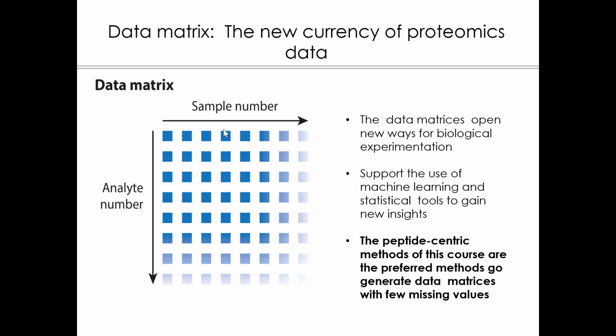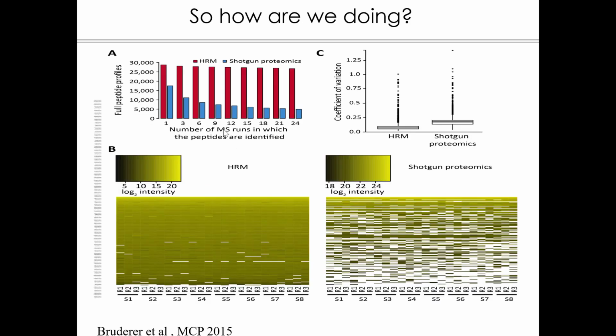with these DIA techniques. So this is now just to indicate, in reality with real data, how these two different techniques, the discovery technique and this DIA technique, perform in this context of generating a data set which we represent as this data matrix.